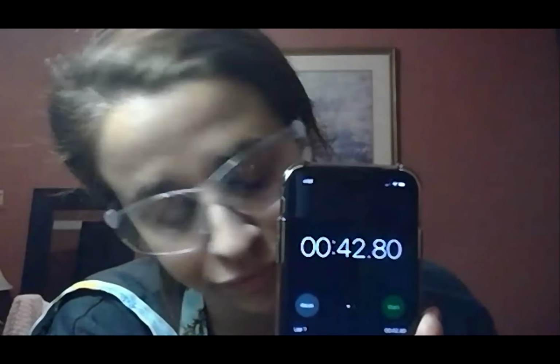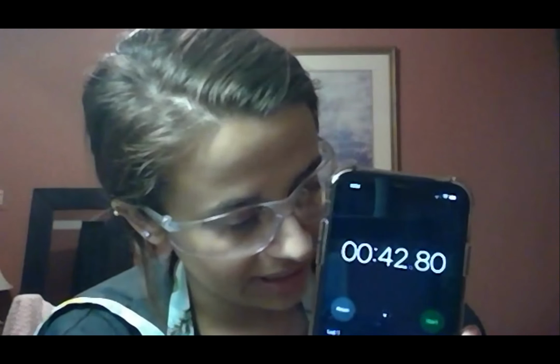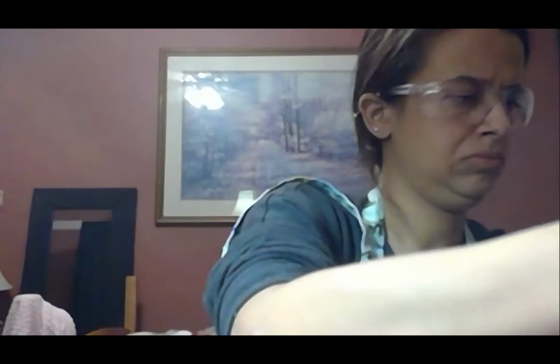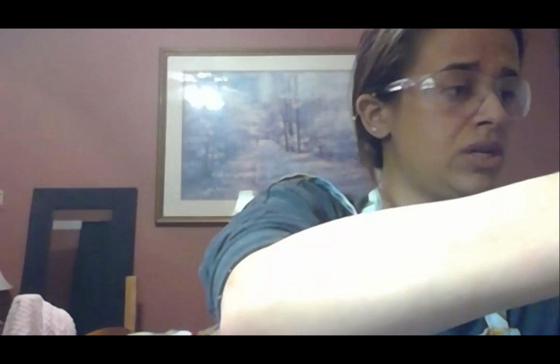Okay, so we'll clock that one at about 42 as well. Even though it's still bubbling, it kind of started tapering off a little bit more. So I'm going to redo test A for us, just so we have a better, more complete experiment. So having them all sort of, oh, this one sort of broke off in a good place anyway. Let's just stick a little bit off.